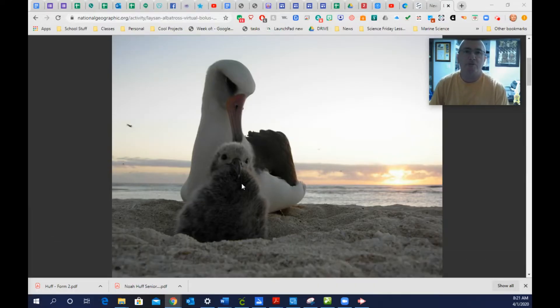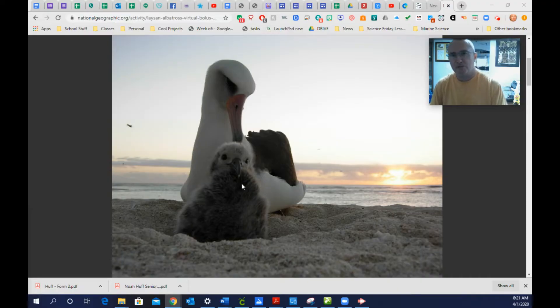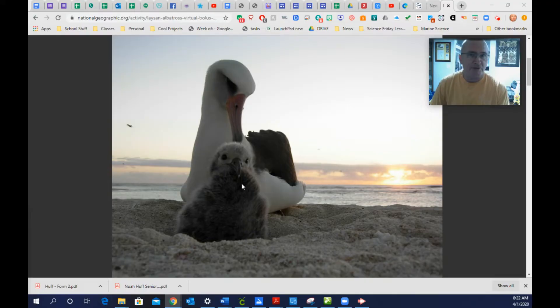Hey everyone and welcome to the virtual Laysan albatross bolus dissection lab. First of all, what is a bolus? A bolus is a regurgitated mass of material that an organism cannot digest. The most common ones we think of are owl pellets — fur and bones of small rodents that they eat.